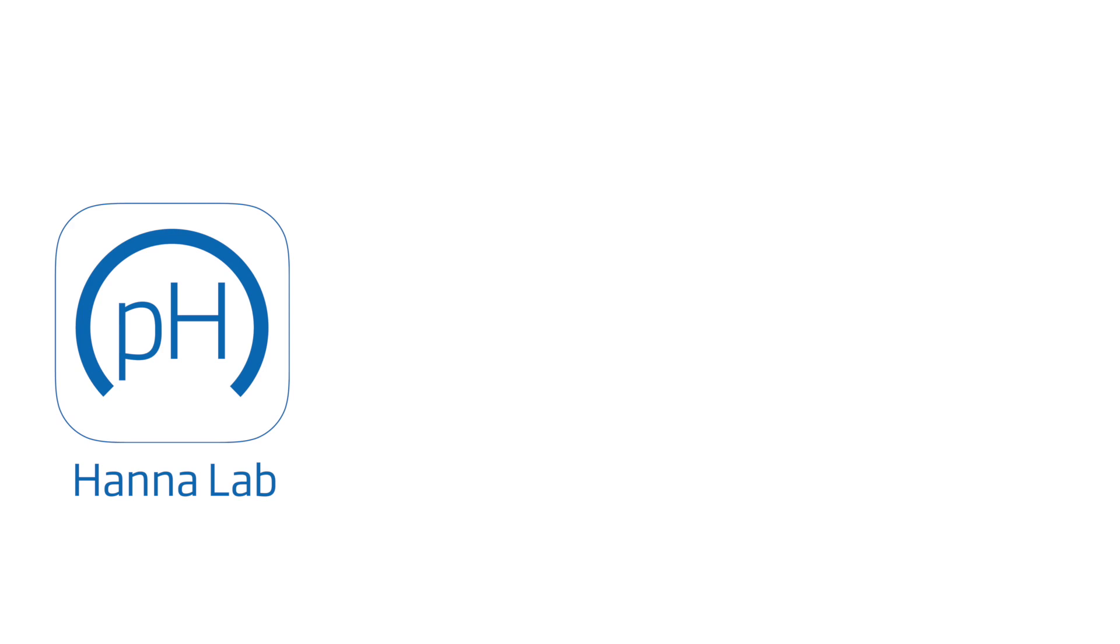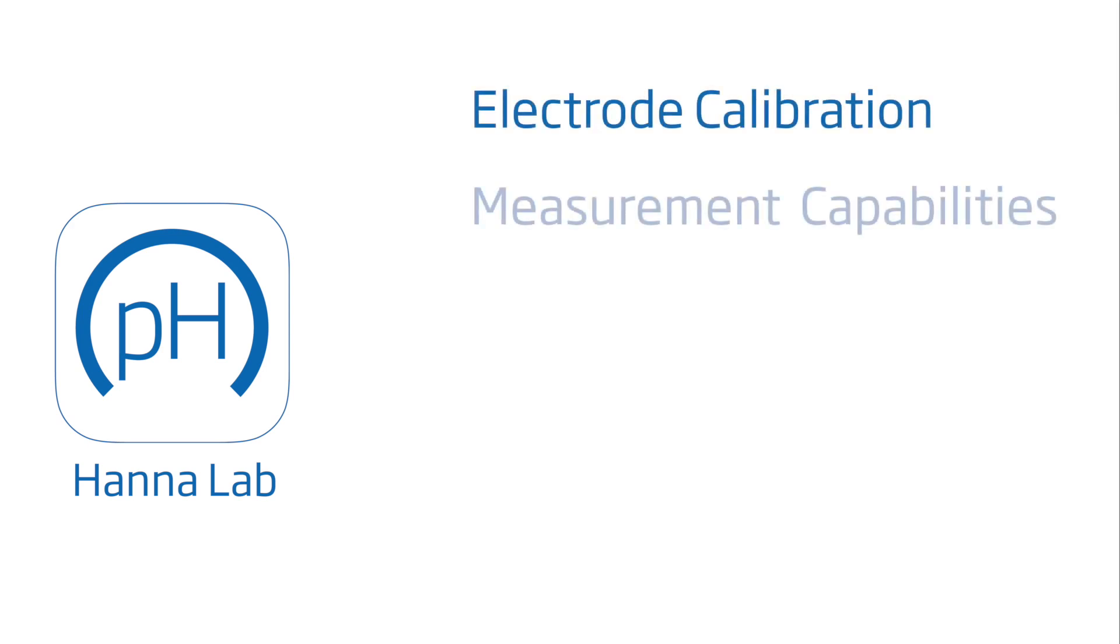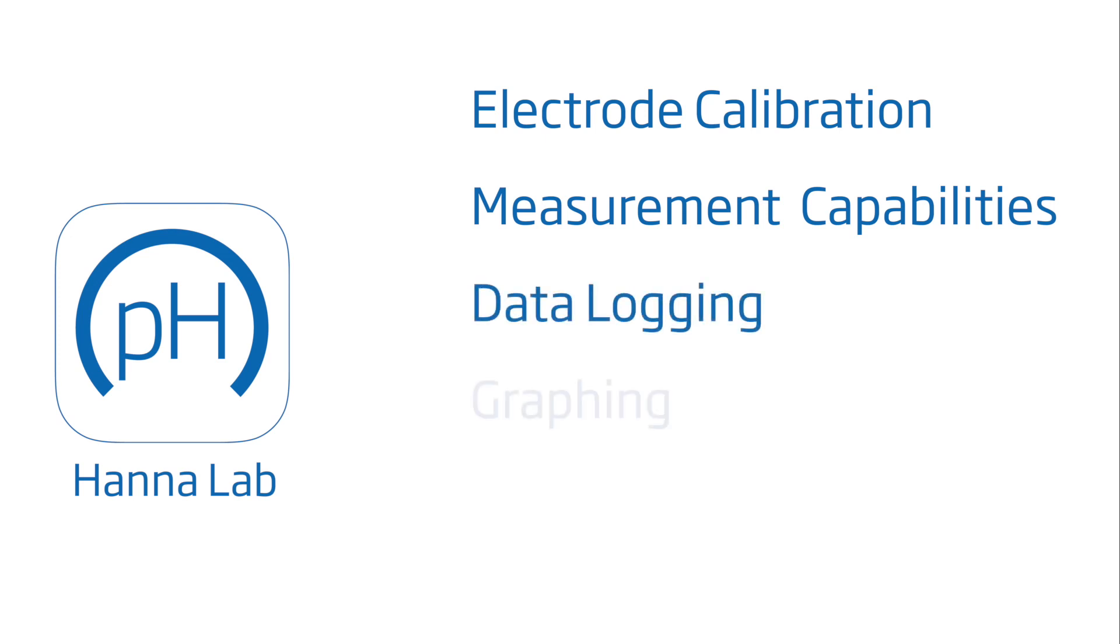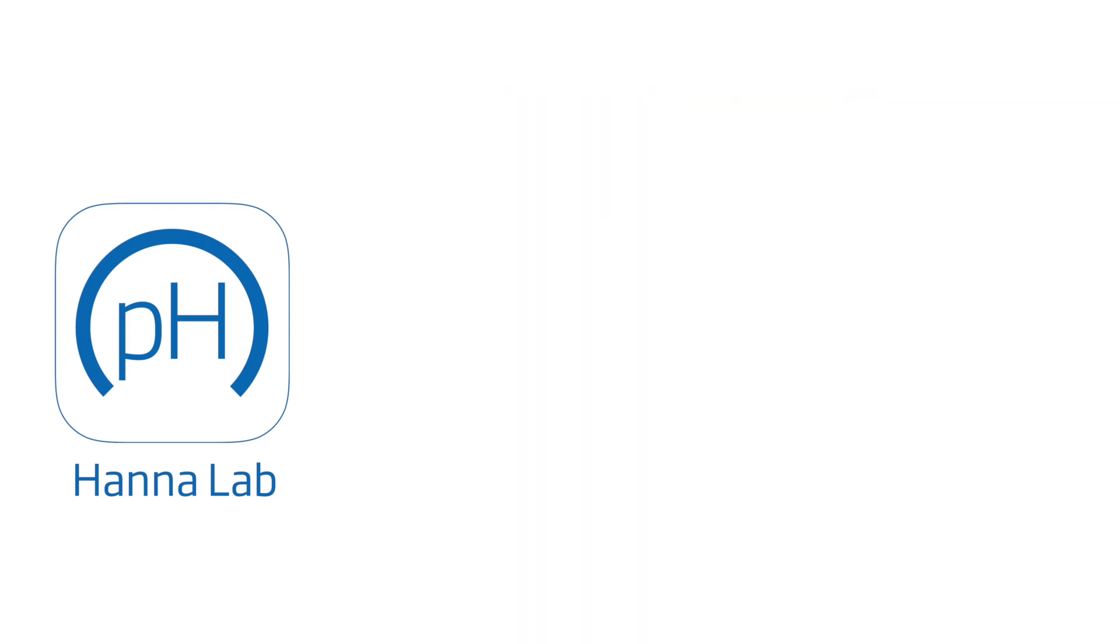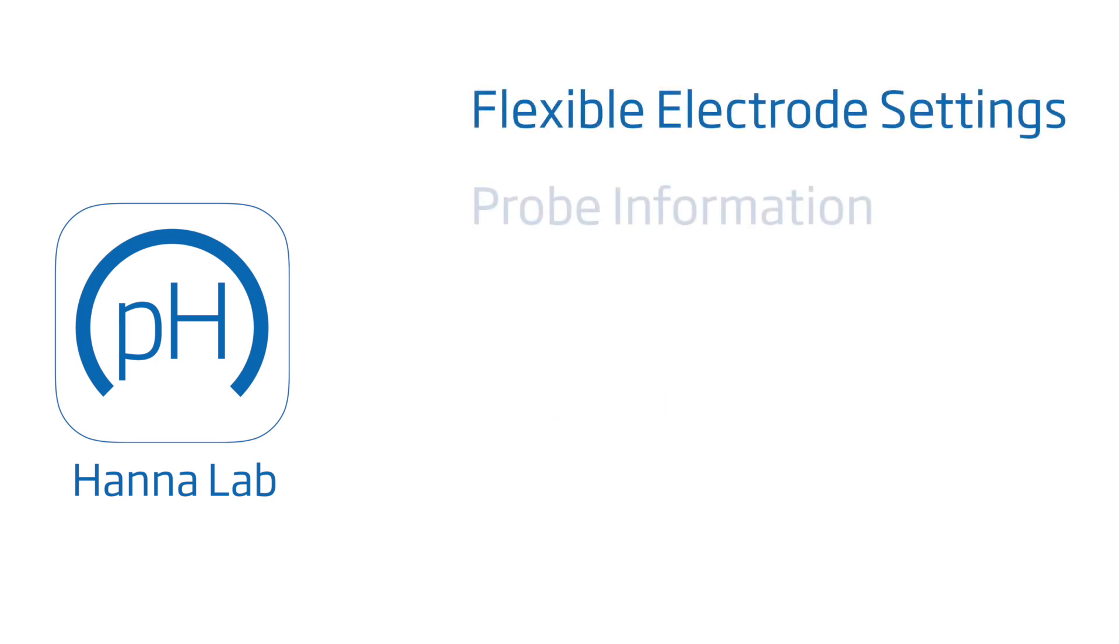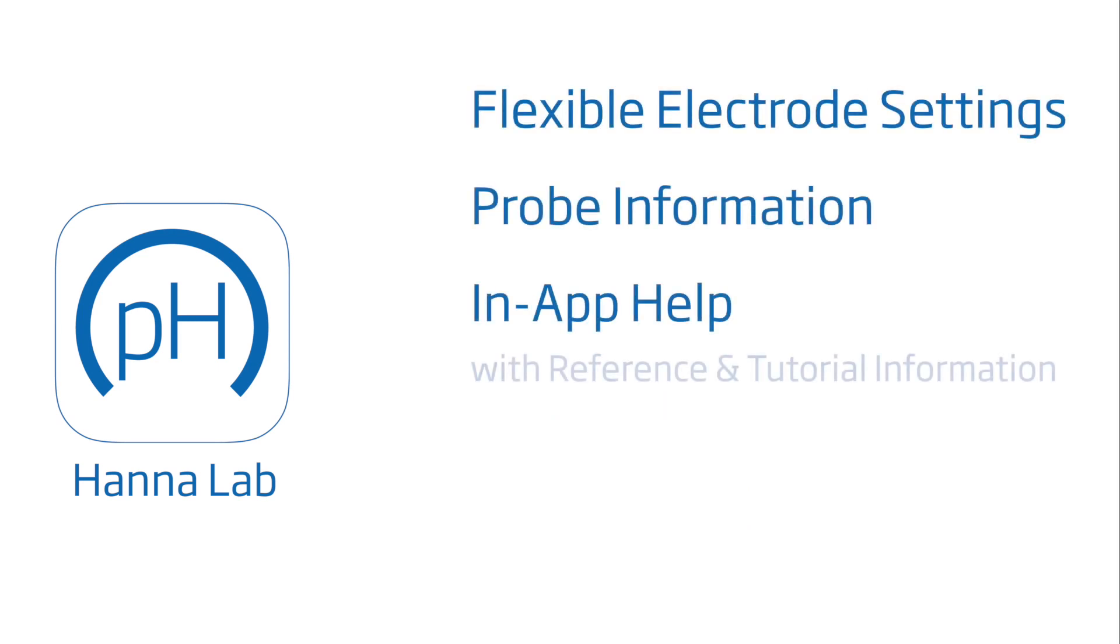The Hanna Lab App features electrode calibration, measurement capabilities, data logging, graphing, and data sharing, as well as flexible electrode settings, probe information, and in-app help with reference and tutorial information.